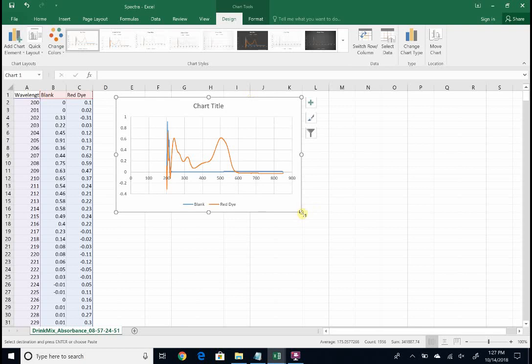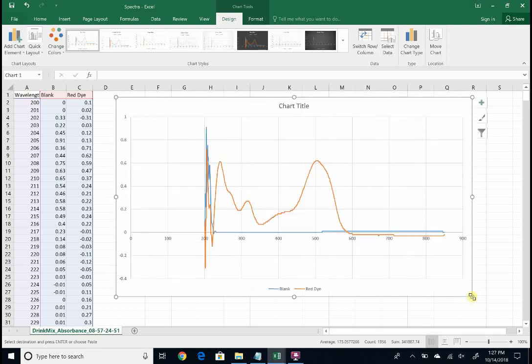and there's a couple things about this plot that aren't ideal. So first of all, there's some data below 300 nanometers that's going to be extremely noisy and not very useful. And that's because this is where we had very low lamp intensity. And so our data really isn't telling us much. And so I want to get rid of that. And then the other problem is the scaling going from 0 to 900 isn't really focusing on the area that we're interested in, which is right in here.